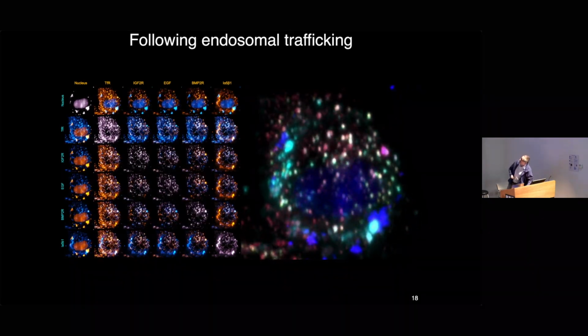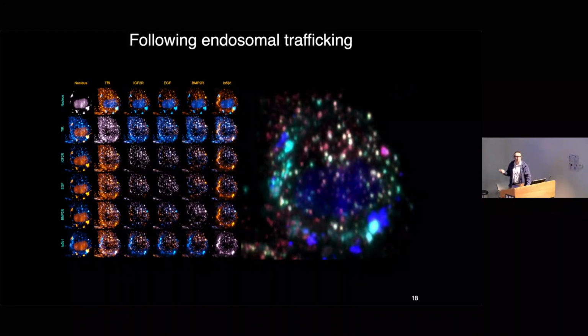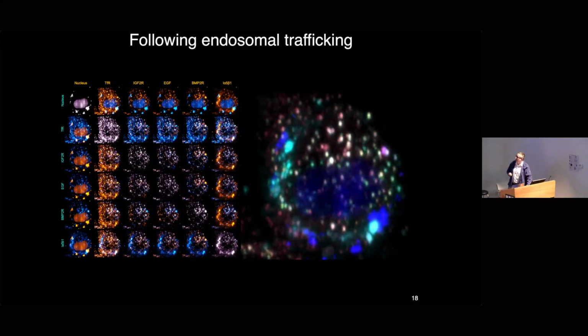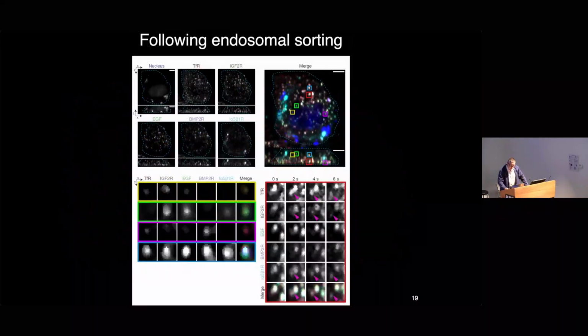it actually doesn't look so good on the projector as it does on the screen, but you can see that there are different endosomes of different colors moving around. And if you look very carefully, you might see that some of these endosomes change color over time. To zoom in on that, if you take a single still frame, we can do the unmixing and then get back to our individual receptors rather than the mixed signals we actually record.